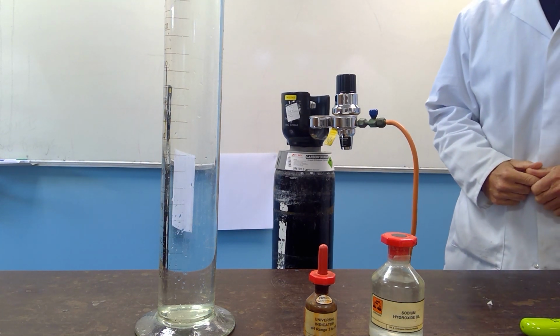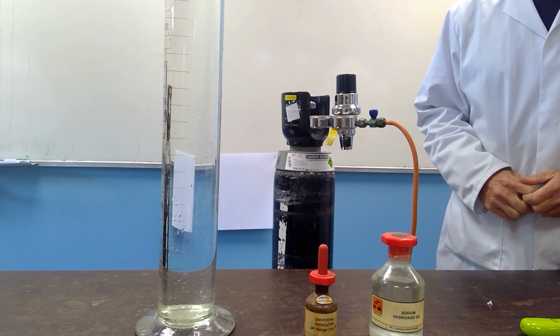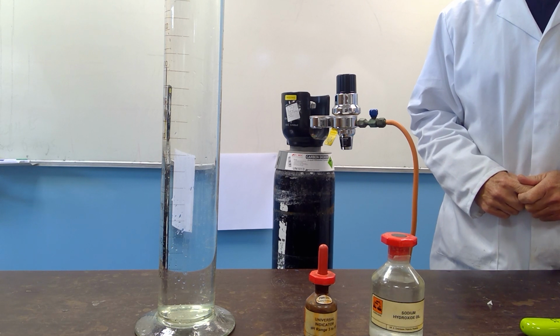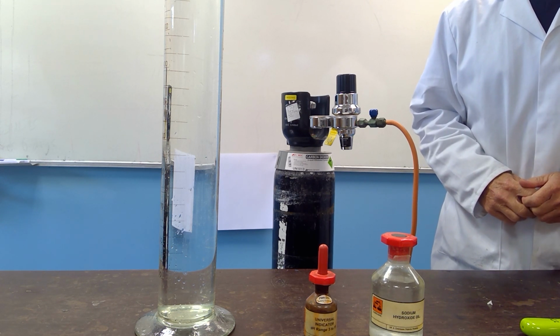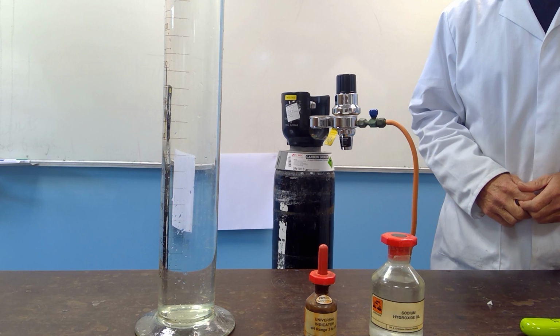In this experiment, we're going to look at another property of carbon dioxide. This property is the fact that carbon dioxide does dissolve into water. We're also going to look at the property that carbon dioxide is weakly acidic. When the carbon dioxide dissolves into water, it produces the acid carbonic acid.